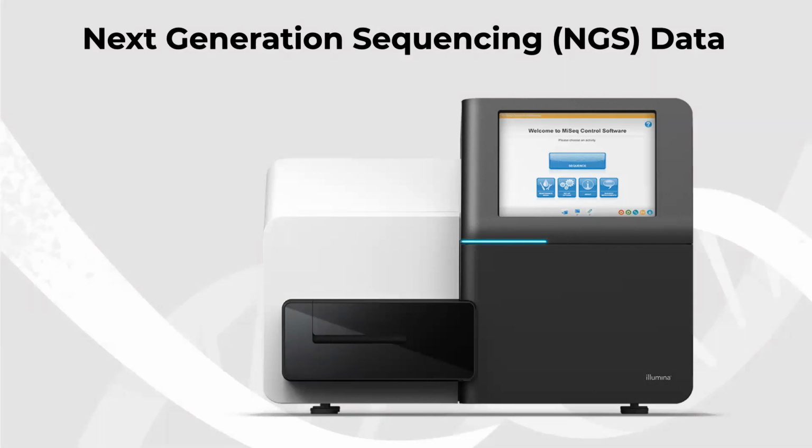Sometimes people also generate total RNA, and total RNA will include any kind of RNA molecules. Those molecules can be poly-A RNA, tRNA, ribosomal RNA, mitochondrial RNA, so many different types of RNAs. There will be a lot of noise, but you will also be able to detect other types of RNAs.